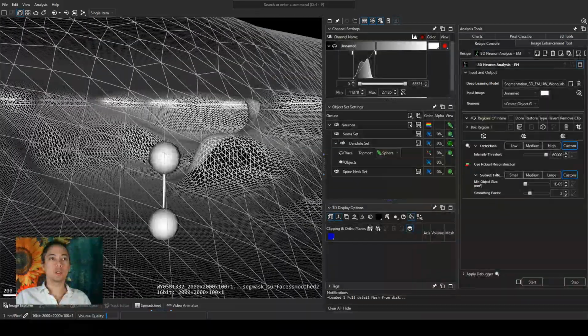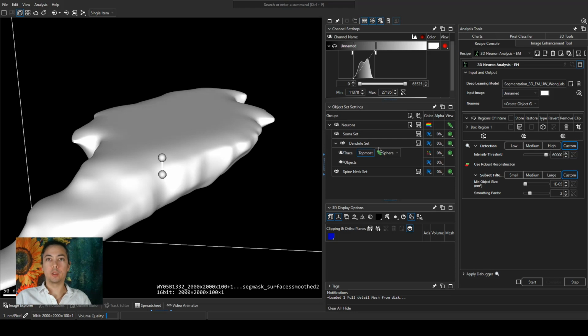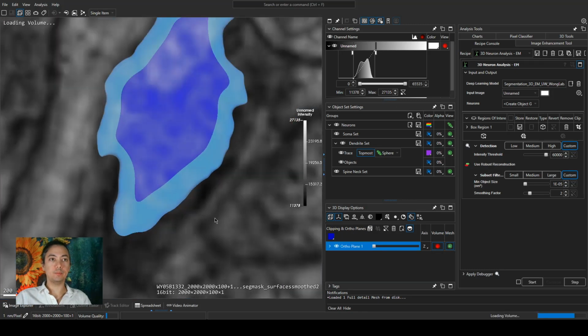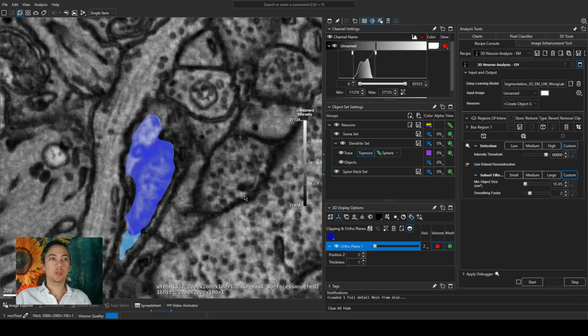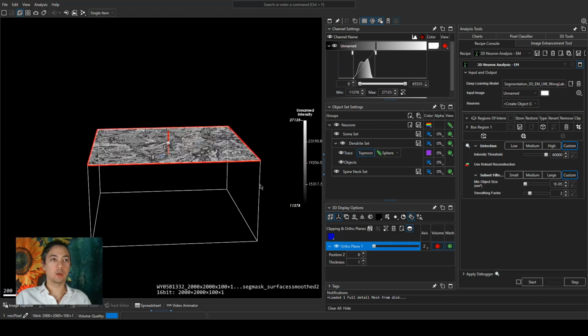Hopefully that comes across on the video. You'll notice it has a center line that you can see through the wireframe, or I can turn on topmost trace, maybe color it, like this. And then I can show you what part of the image it was detected from here, and then pop this down so we can see it. So it's actually just on a few slices here on the top of the image. If you look here.